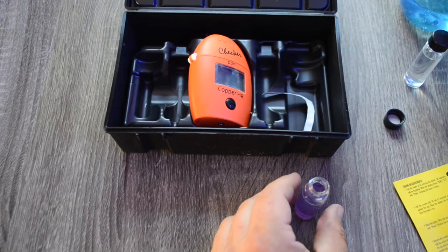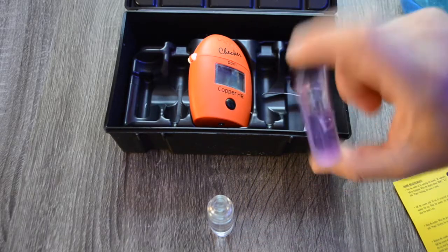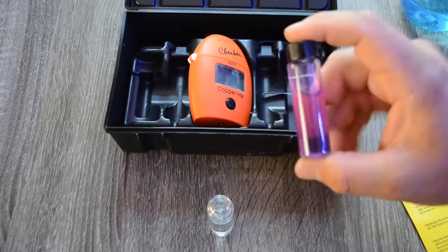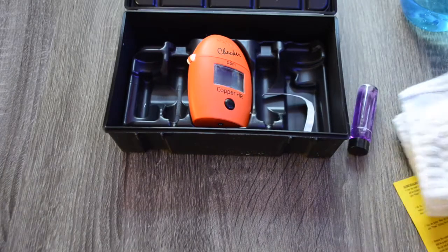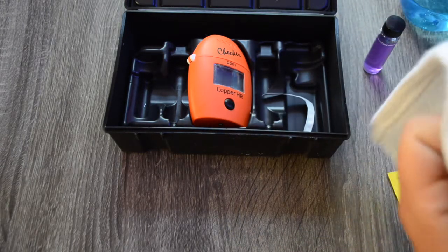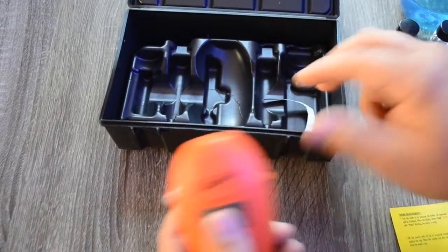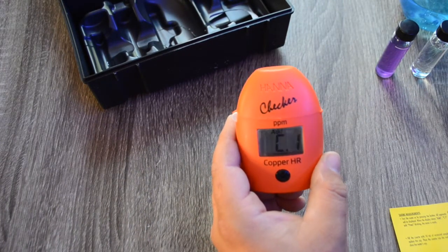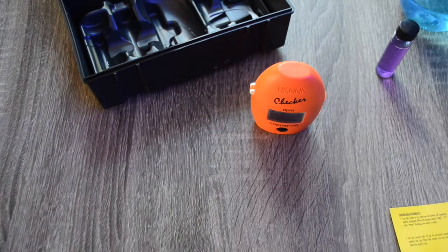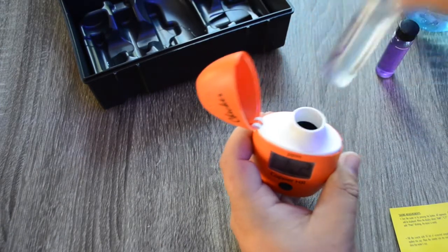That's how you add the reagent without getting it all over the place. The reagent turns the water a little bit purple — just interesting. One important thing before you add these into the checker: make sure there are no fingerprints or anything on the container whatsoever. Wipe it down and handle it only by the lid. We'll turn on the Hanna checker — it says 'add container one and press' — so we add the one without the reagent and it takes a reading while flashing.